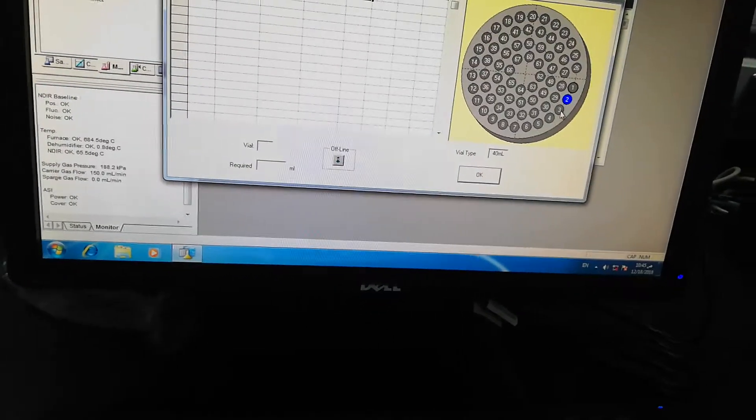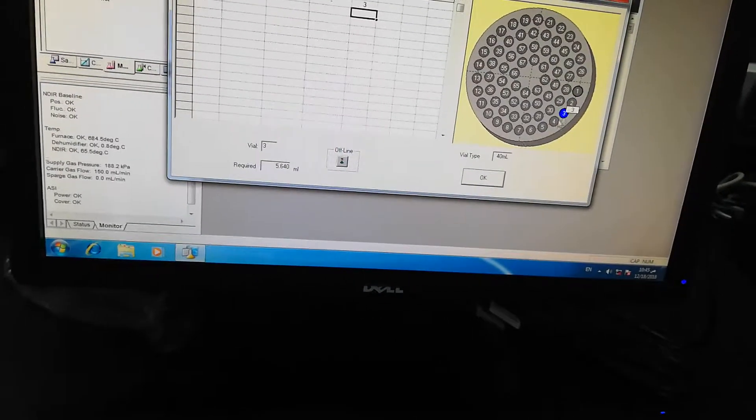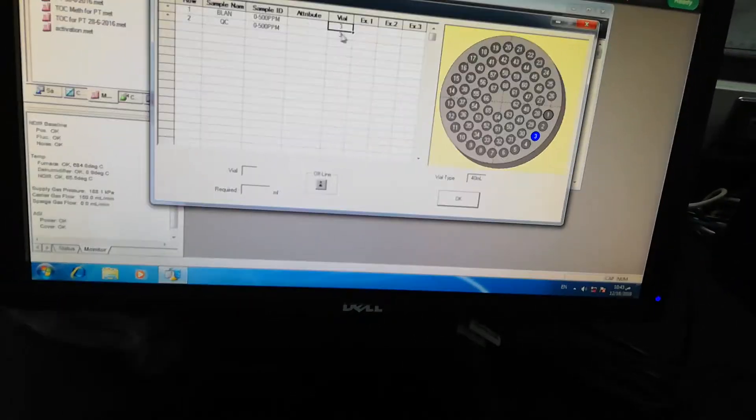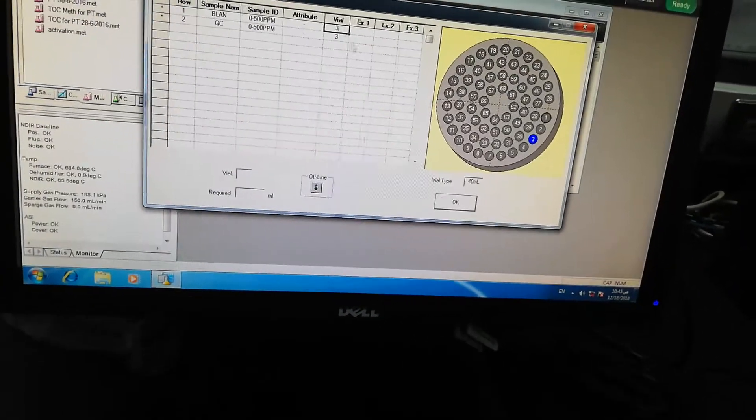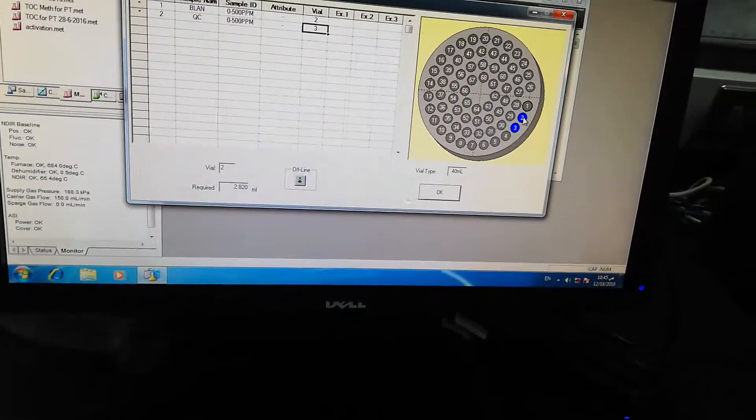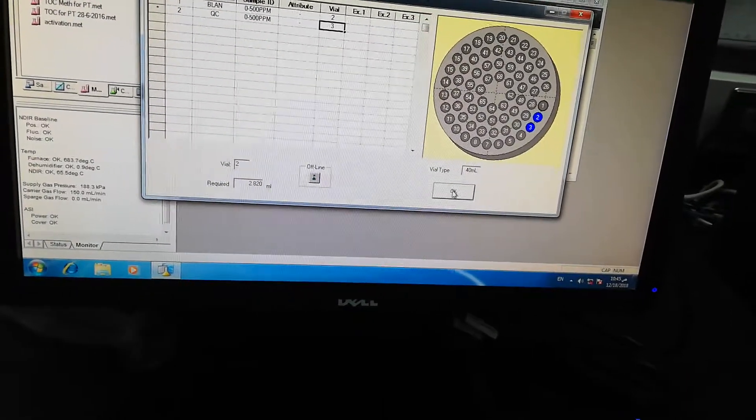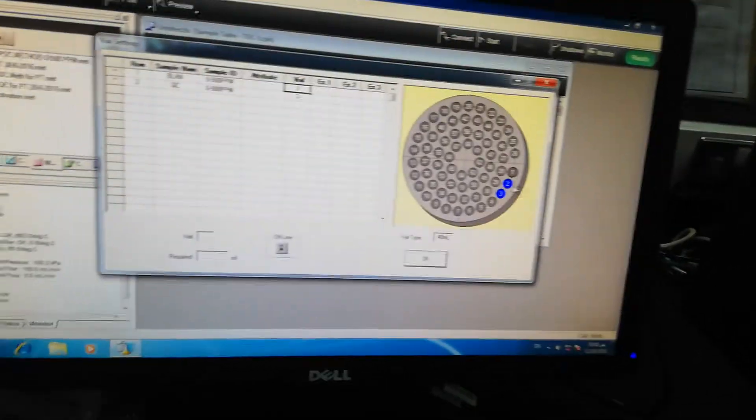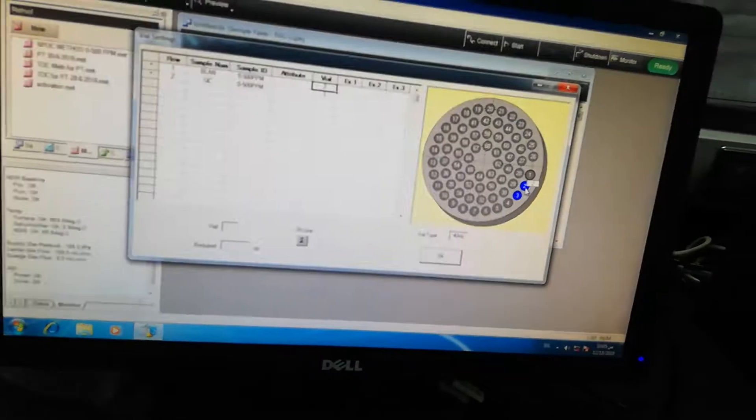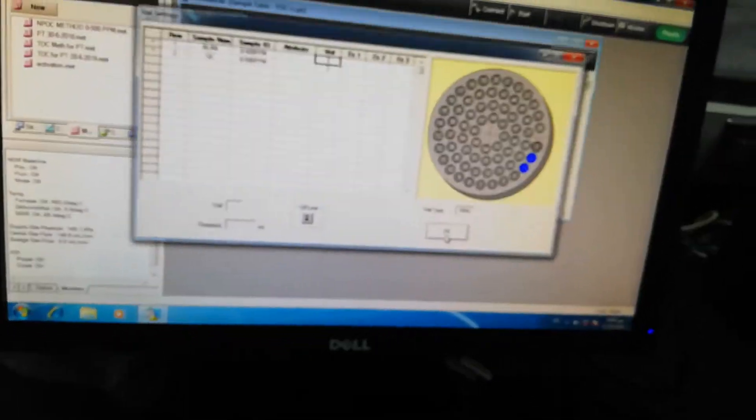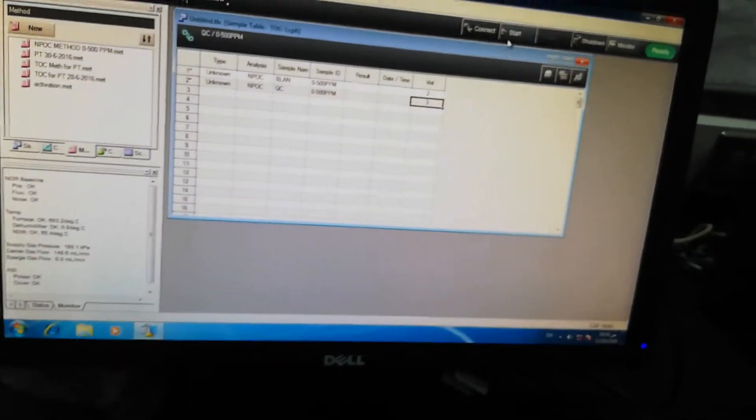And now okay, so now you can recheck it. Yes, this is 2 and okay. So now on auto-sampler, vial number 2 and vial number 3 are ready for analysis.